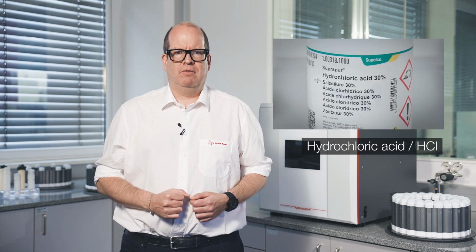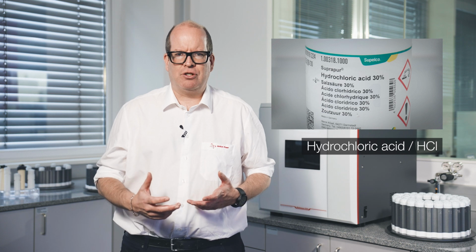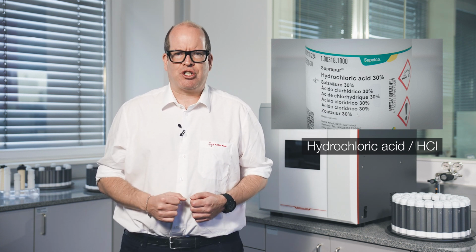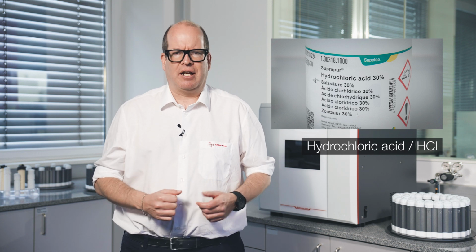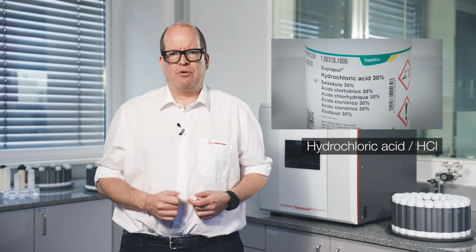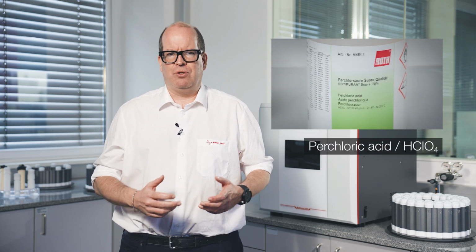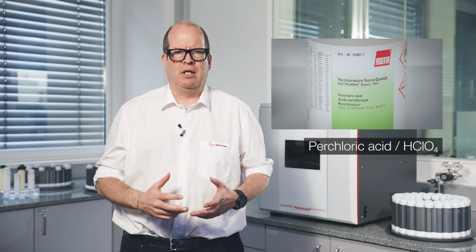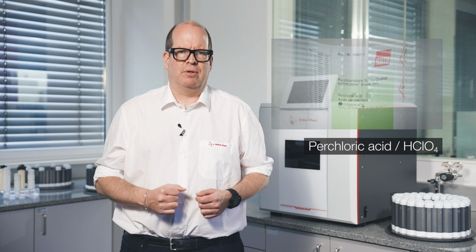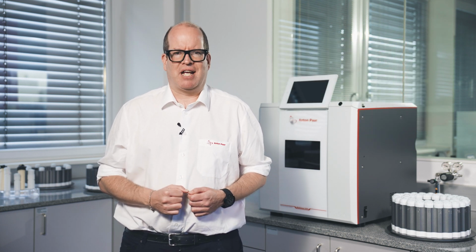Hydrochloric acid. For analysis of mercury and iron, a small amount, like 1 milliliter of hydrochloric acid, is added to the solution right after the digestion in order to stabilize the analytes. Otherwise, they tend to adsorb to the vessel wall and the recovery rates are too low. Perchloric acid introduces even more oxidative power in case the nitric acid is too weak and the sample can't be broken down. Inorganic samples often require mixtures of different acids.